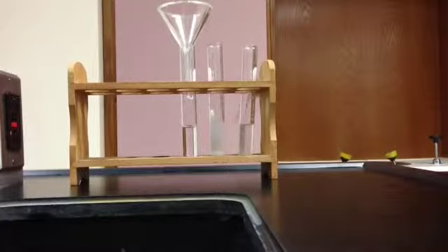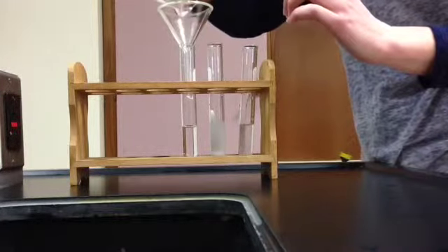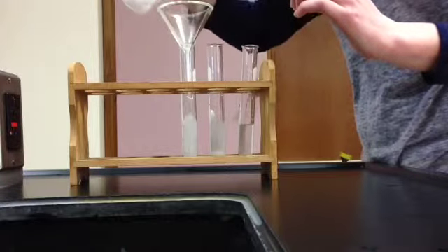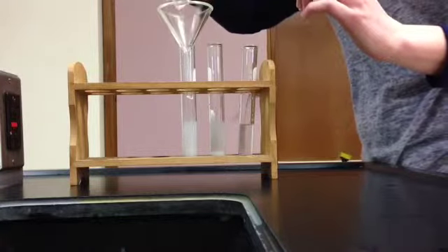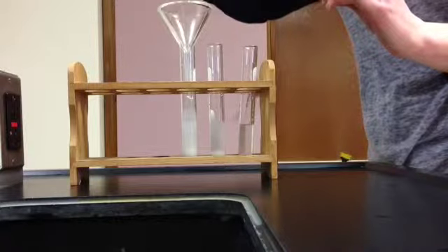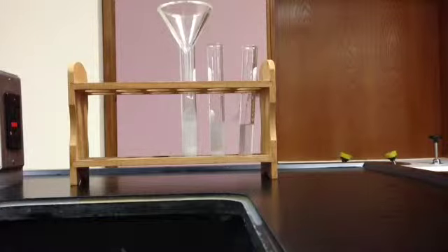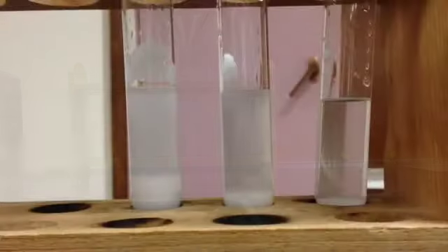For the third test tube, I poured 4.96 grams of salt in the test tube, which is a lot more than the rest. This shows this one will not dissolve all the way because it has reached the maximum solubility of salt and will no longer dissolve in 10 milliliters of water because it is 1.34 grams over.